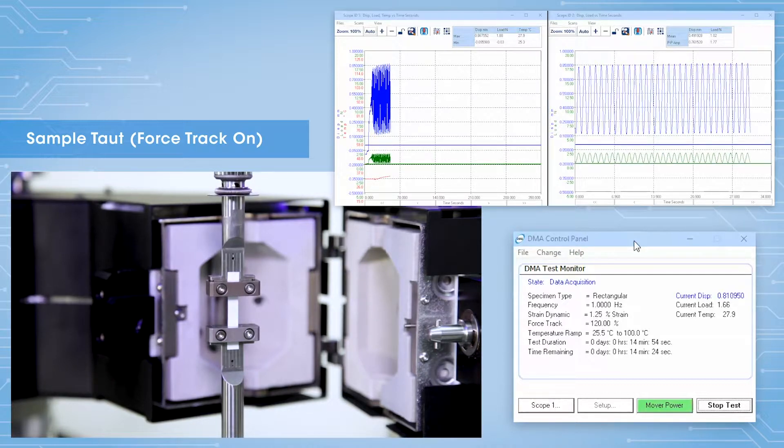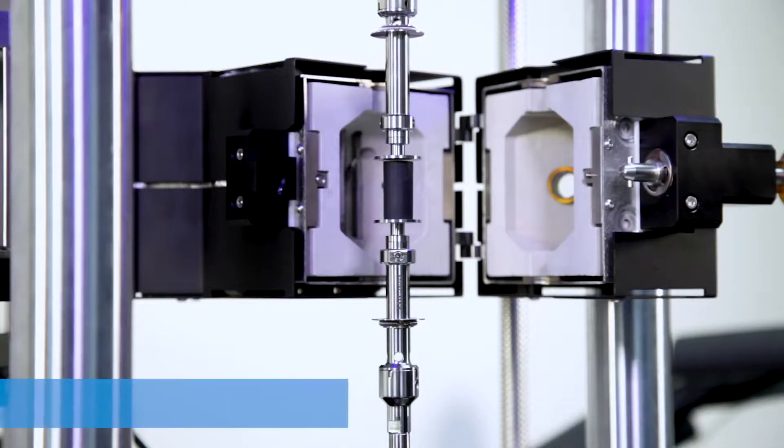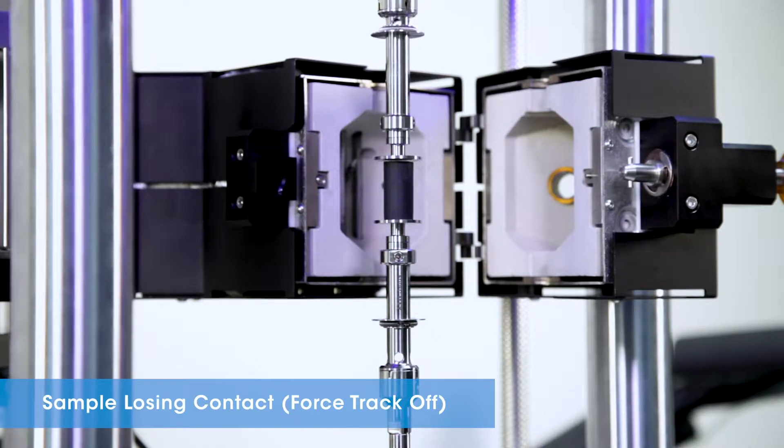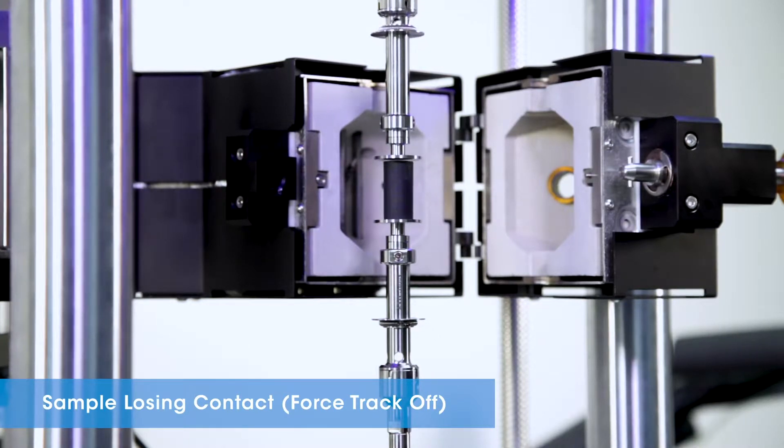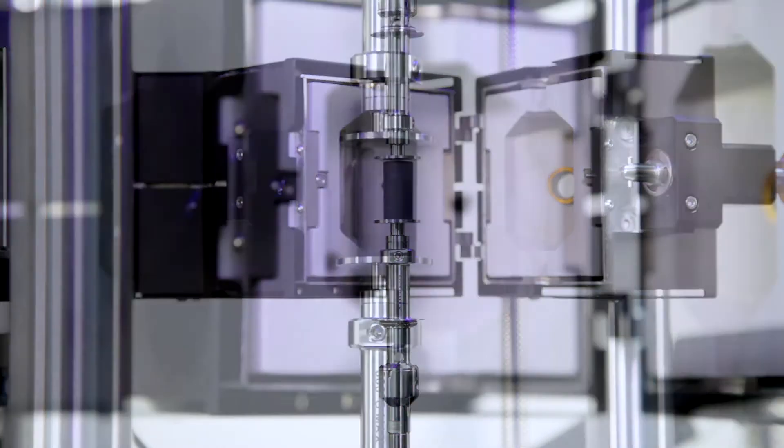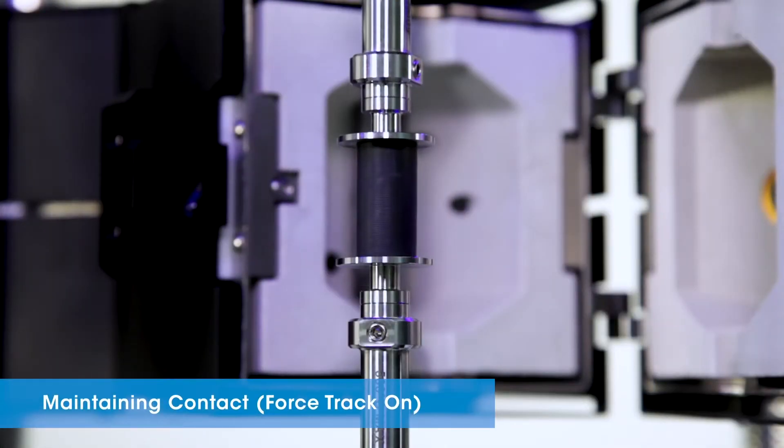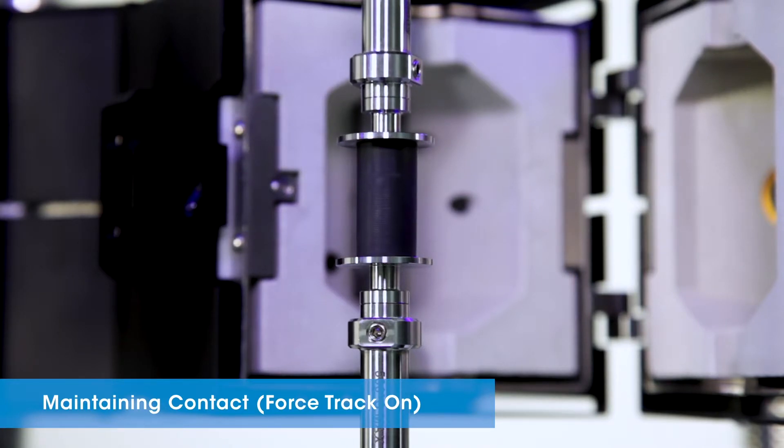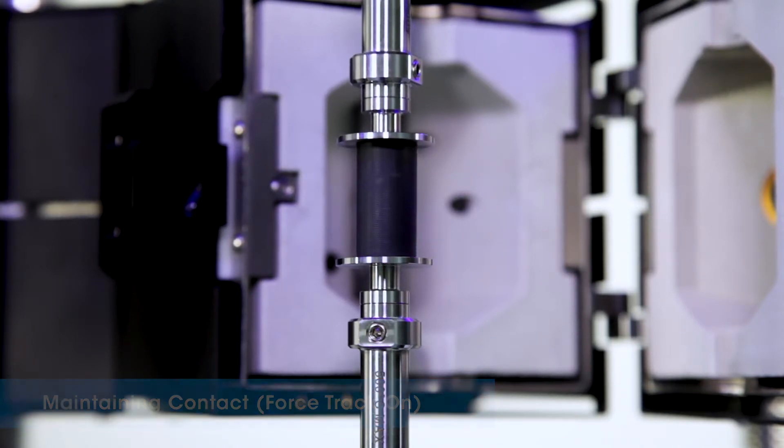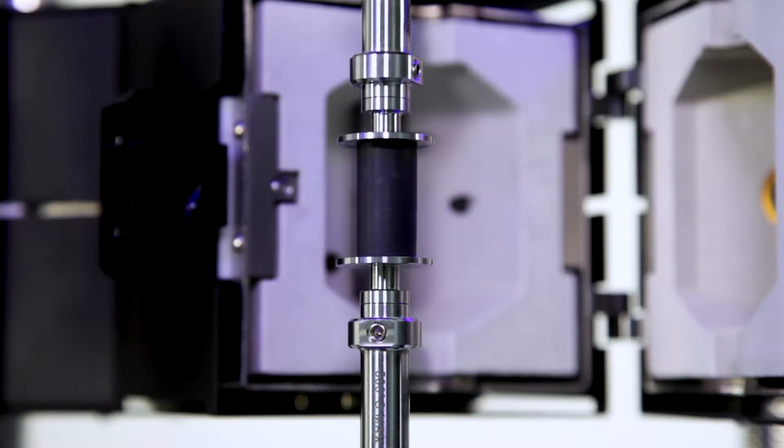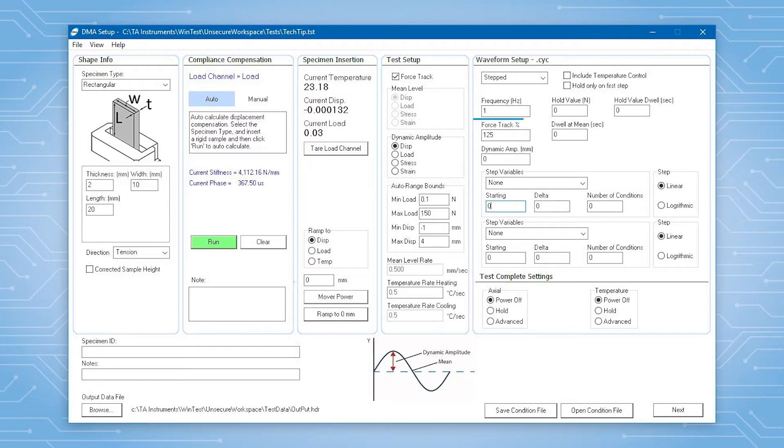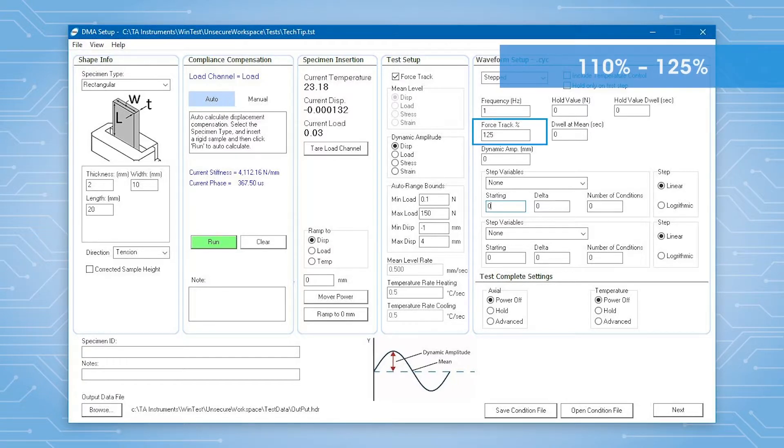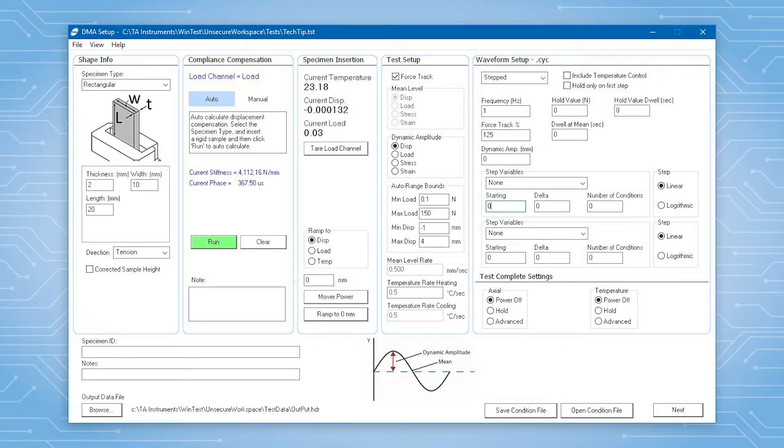Similarly, if you do compression testing or 3-point bend testing, you also need to use force track to keep the specimen in contact with the upper geometry. A force track of 110 to 125% is usually a good value to start with.